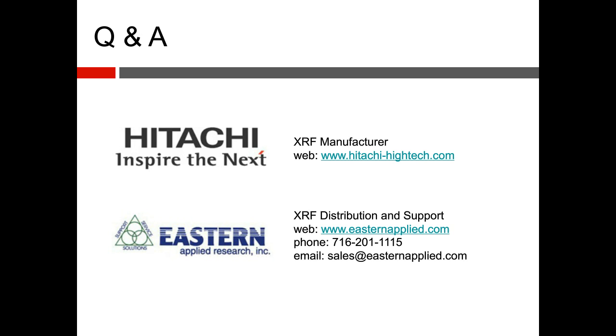So you do not have to adjust the head to the predetermined head height as long as you calibrate it in the free mode. Hope that answers the question. If not, Ivan, reach out to us and we can clarify.